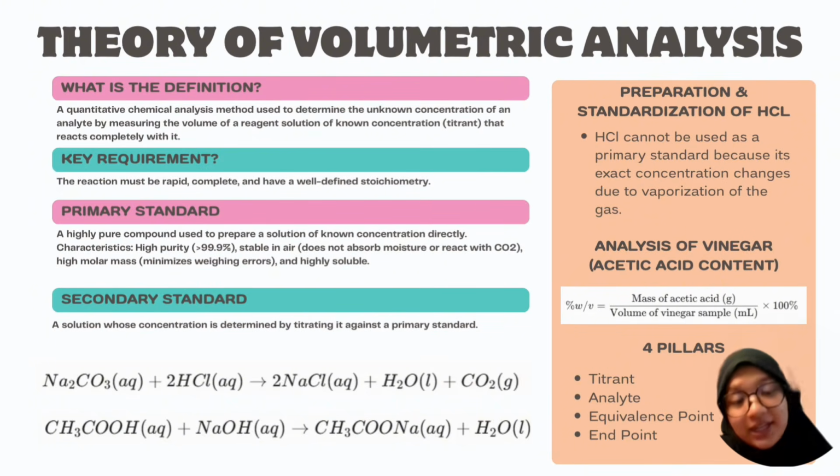Let's move on to the vinegar analysis. Alright. So once we have standardized our solution, using the 1:2 mole ratio, we can use it for practical applications, like analyzing commercial vinegar in Part B.